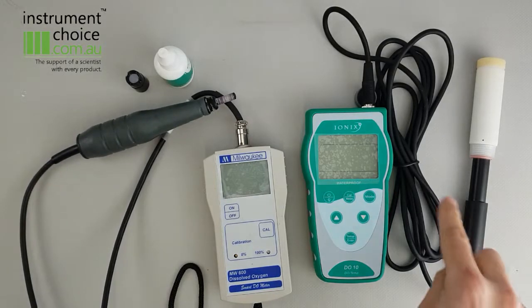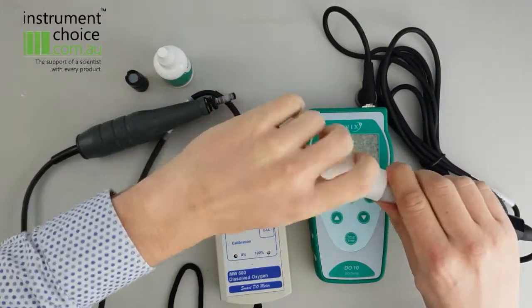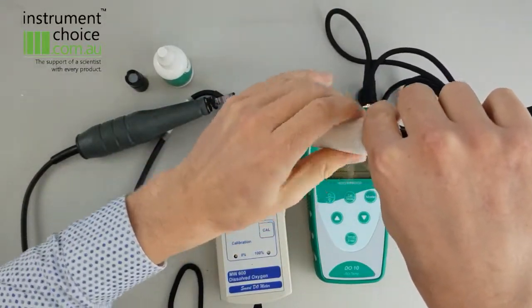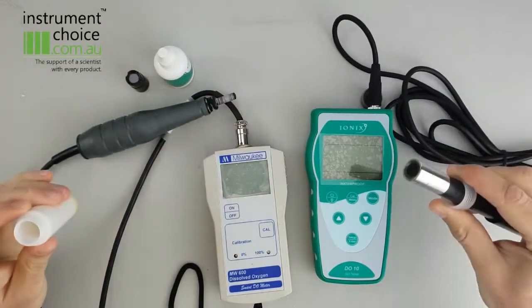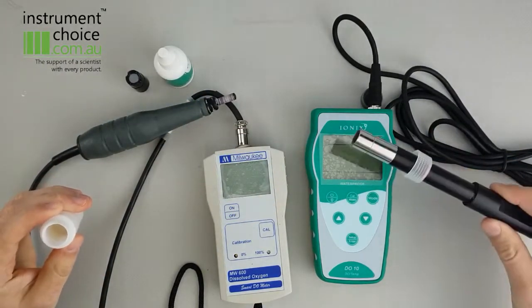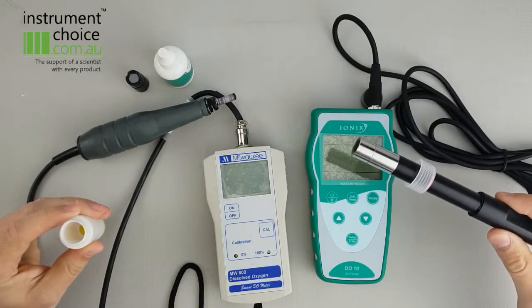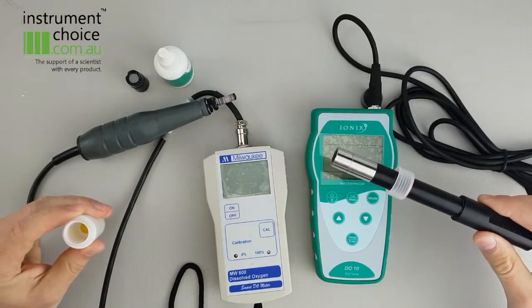So the DO10 on this side here is an optical DO meter, slightly different functionality to a polarographic sensor. Basically these ones use fluorescence to take their readings, which makes it a little bit easier in terms of calibration, maintenance and those kind of things, because you're not looking to have to replace a membrane or the electrolyte filling solution.